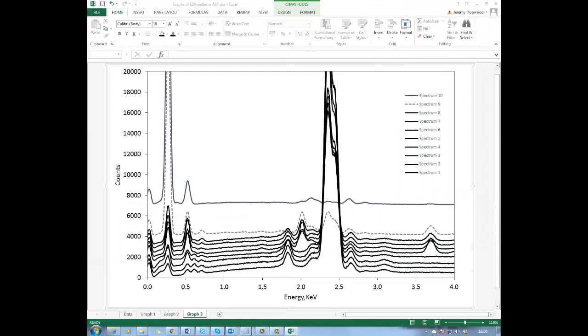If you have a spectra to look at, then it's quite easy just to go and label them. So I'm copying from the other graph now. Carbon, I'll label that. I'll put the carbon here, up there. Put the oxygen here. Oh, sorry, the carbon. I'll change it to oxygen. So all the peaks down here are oxygens. So I'm only going to label that peak there.